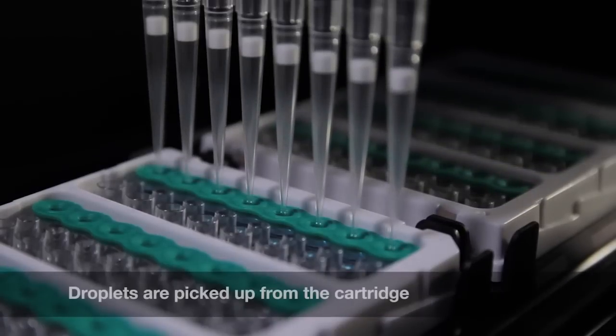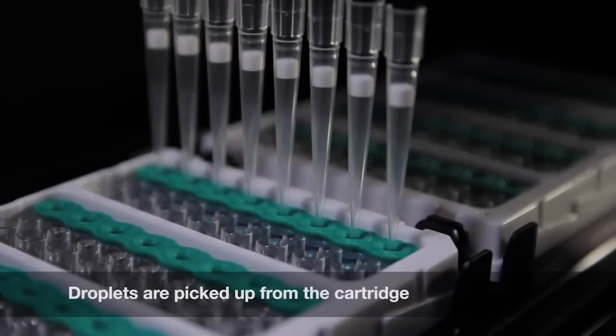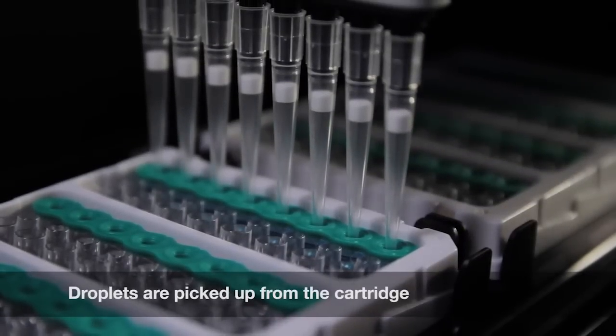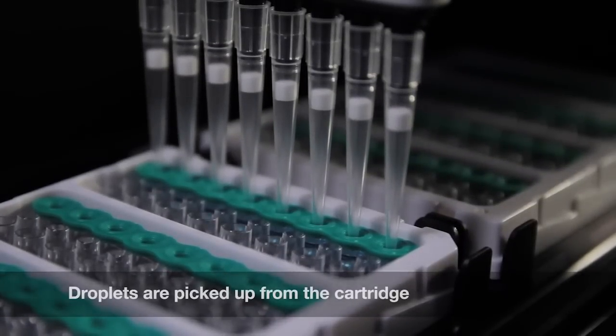Once droplets have been generated, the AutoDG gently transfers them to the matching column of the droplet plate.